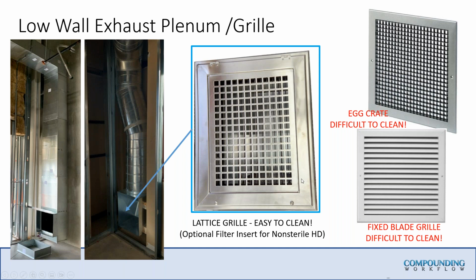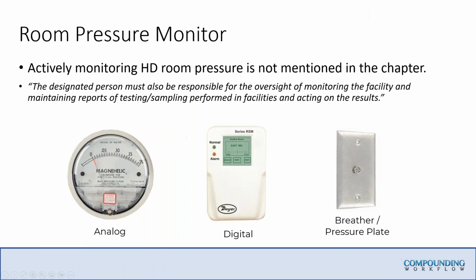And in a future state, per USP 800, when you have to DDCD, deactivate, decontaminate, clean, and disinfect, is that a 2-step process, 3-step process? Who knows, right? That's up to you, and that's a little outside of my purview. I would not want to have to DDCD either of these two designs. I would rather do the lattice face. So that's my advice. If you want to make something easy to clean, make it a lattice face.